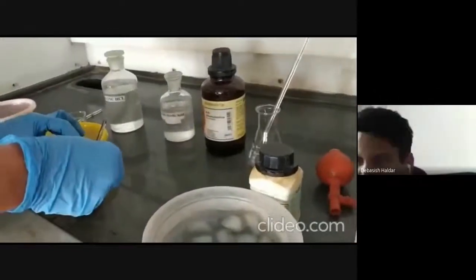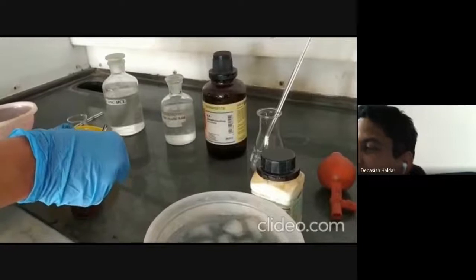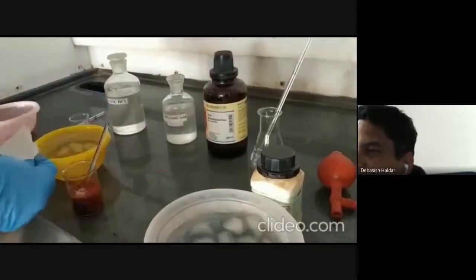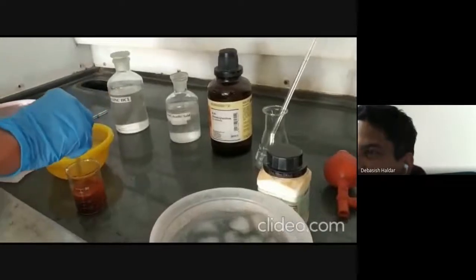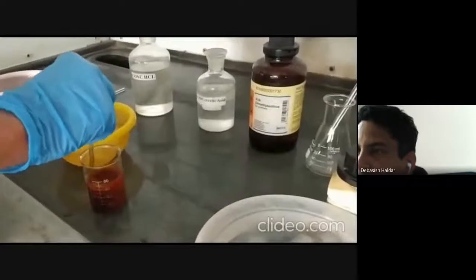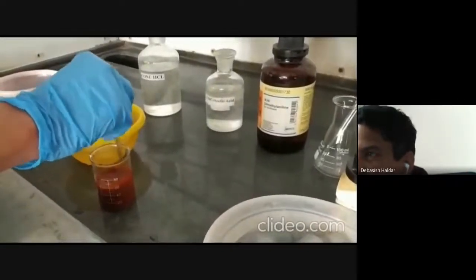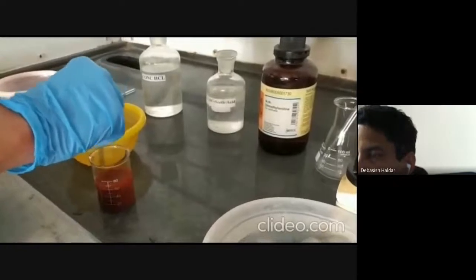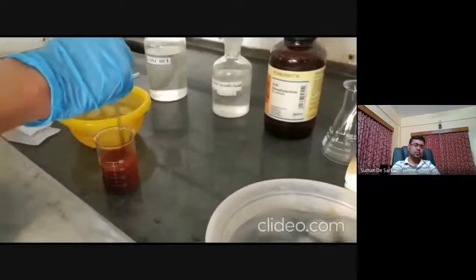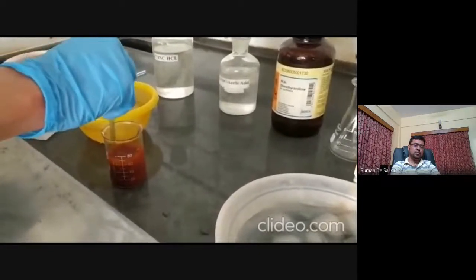So there was a heating part at 80 to 90 degrees centigrade, but during editing of this video that was removed. It's a long process of heating, so we just removed that part. But there was a heating part. So the bigger coagulation of methyl orange takes place.